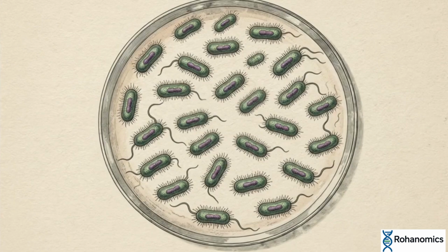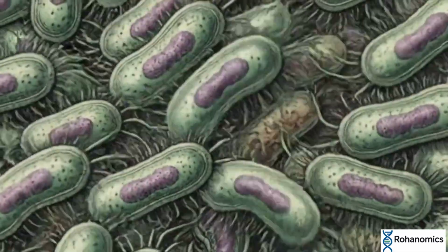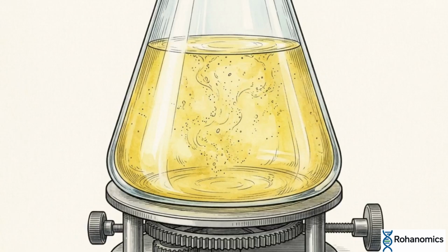A single bacterial colony can multiply into the billions overnight. When you are monitoring a culture, tracking this replication rate is mandatory. But at densities of millions per milliliter, the human eye cannot track individual cell membranes fast enough to produce a reliable count. The sheer volume and three-dimensional density of a liquid culture creates a bottleneck.